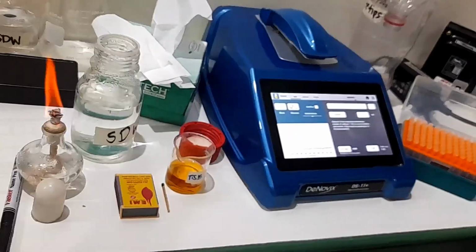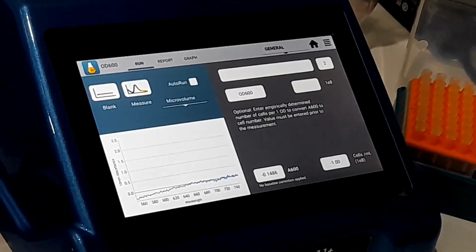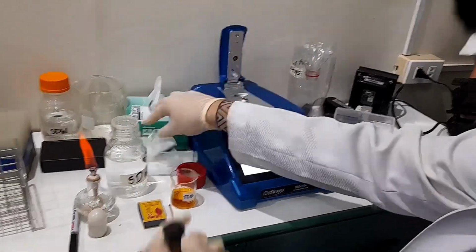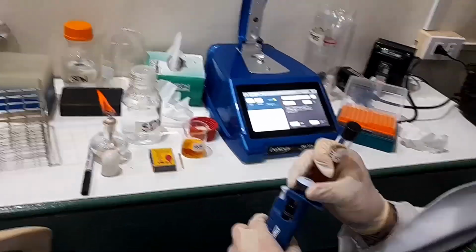So there, it gave the measurement. What is negative 0.1, sir? Negative 0.1. Yeah. Oof. Here, let me do it. It's been used already, sir. Since that's one year. So when was the last time you used it? April? April? Yeah.